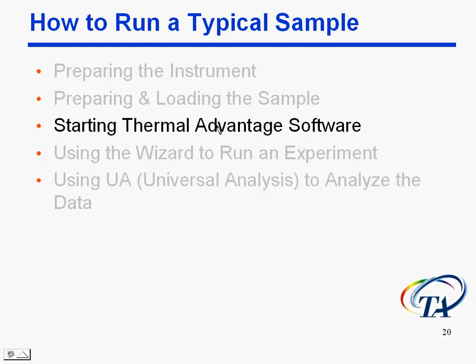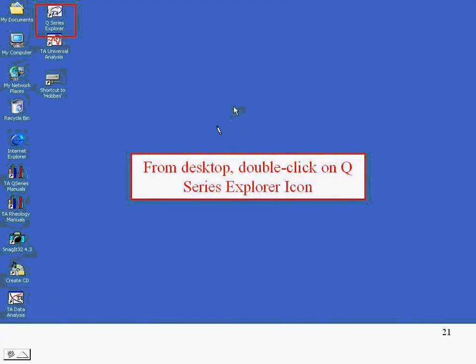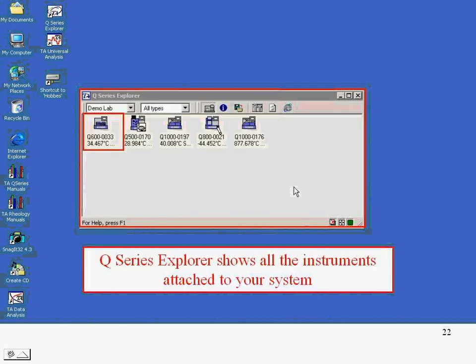Now we're going to go through the software. Normally, the Q-Series Explorer starts up when you first start up your computer, excuse me. But if it's not, there's an icon on your desktop, and you can double-click on it. Now, when we open up the Q-Series Explorer, it shows all the instruments that are attached to the system. Here we've got the Q600 highlighted that we want to open, but there's also other instruments like a TGA and a DSC and a DMA. So if we double-click on this Q600, it'll open it.